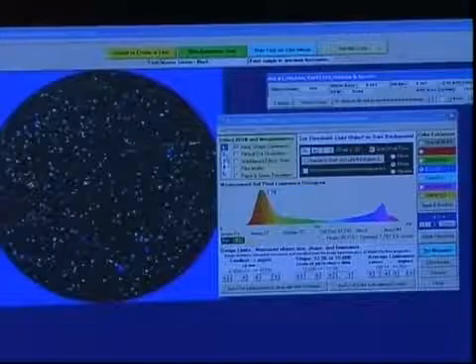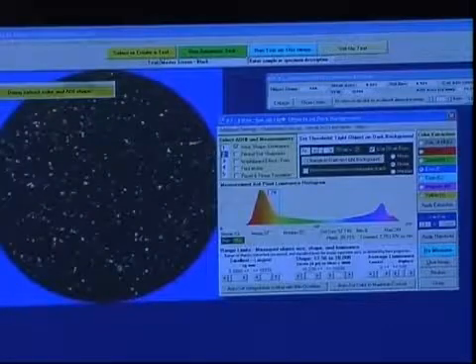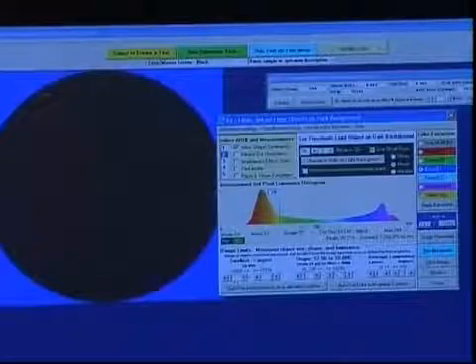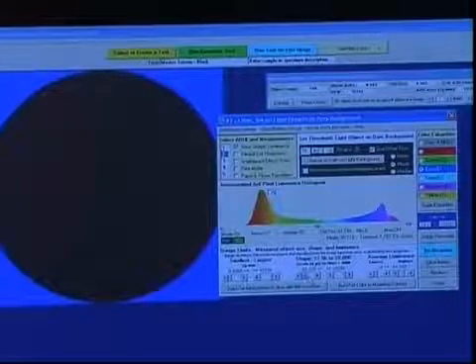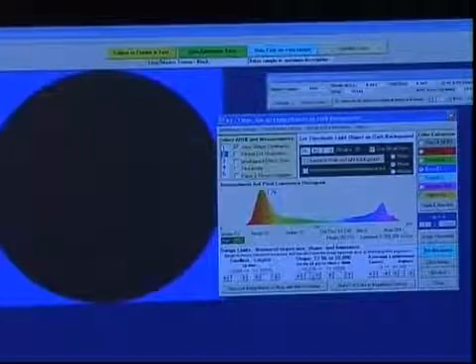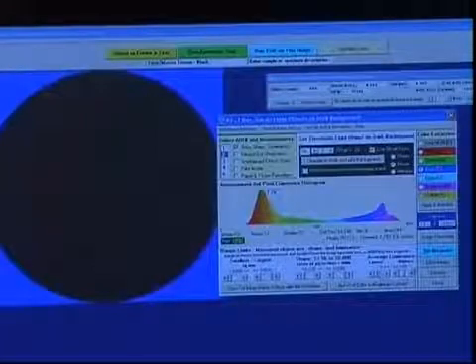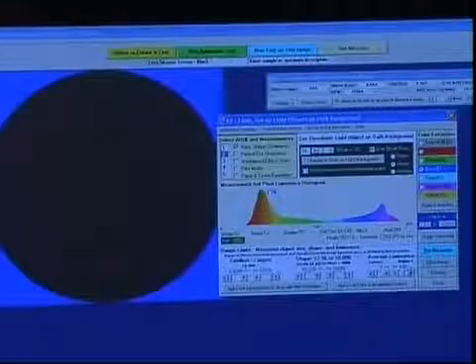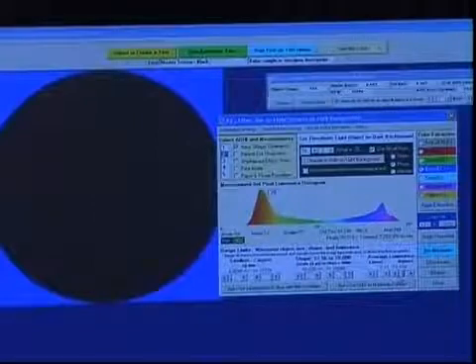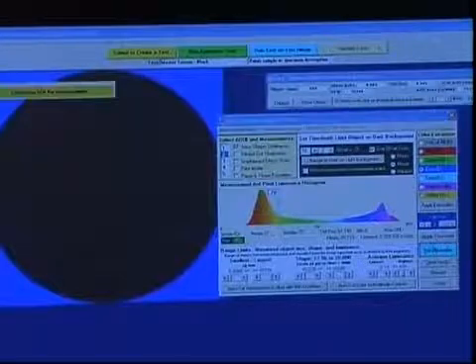So we'll take the next AOI, and that is the fiber. And we'll do the same thing. It is set up 0.08 again, but this time the shape is 45 to 10,000. So we want everything that is not round. And the luminance, though, we want only the darkest of these. So it goes from 0 to 109. This was set up previously, and we'll go ahead and make the measurement.